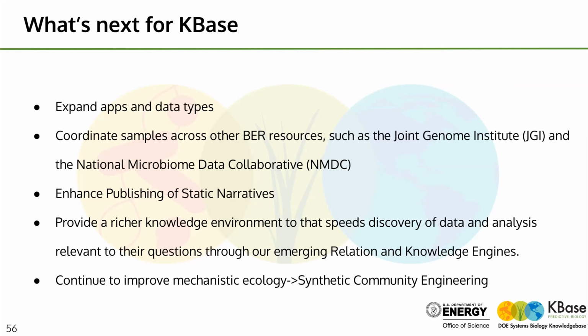And that's really powerful because it means if you are working with one of those agencies and you get data into their systems, you'll be able to transparently move your data from one place to the other, maintaining their sample information. So enter once, use everywhere. We're enhancing the publishing of static narratives so they're richer.